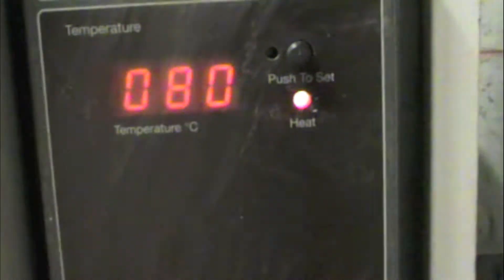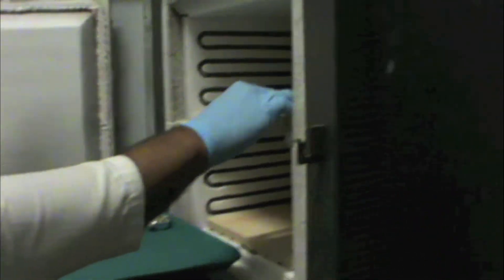Right now these are at 80 degrees. We keep a lot of the temperature. What is this machine? Oh, just another oven — could be a convection oven. These are all a bunch of different ovens; different people like different ovens. Alright, so that's about it for the ovens. We're going to ash these for about four hours in the oven, and then Martin's going to have to come back in four hours and take them out.